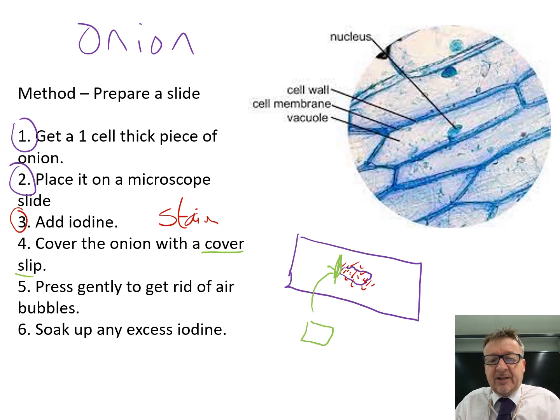Press very gently on the cover slip to get rid of any air bubbles. Air bubbles look like cool circular discs under the microscope, but you don't want them. Don't press too hard though, as you can break the cover slip.